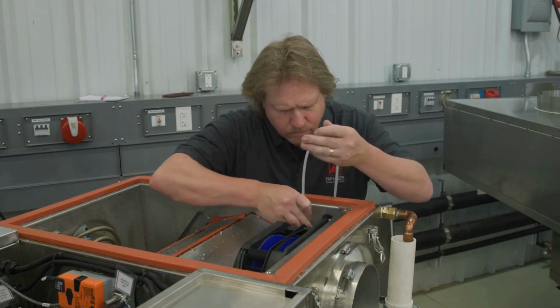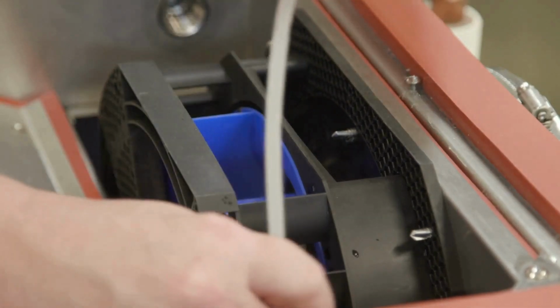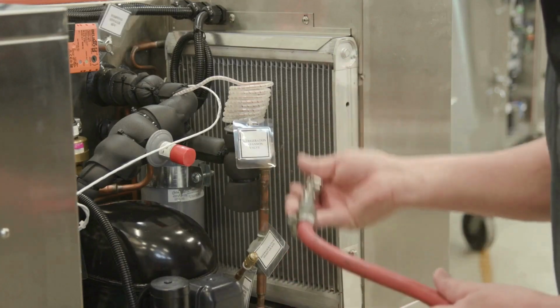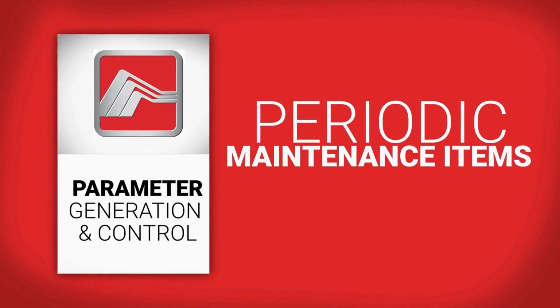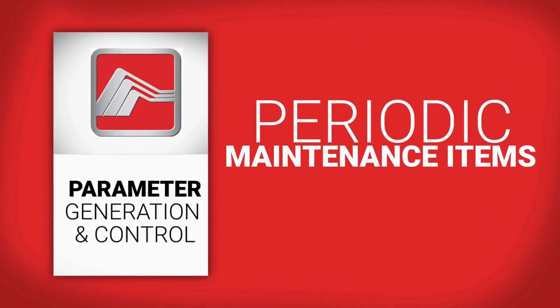Clean the blower area as necessary. Clean the air-cooled condenser and mechanical area as necessary. Next, we will review periodic maintenance items. Note that if your customer is responsible for their own periodic maintenance, please stress the importance of these steps.